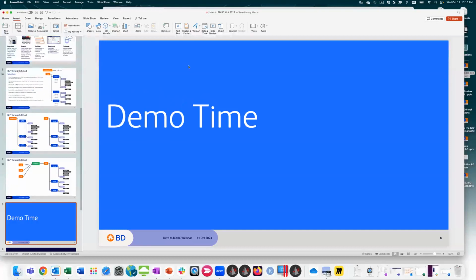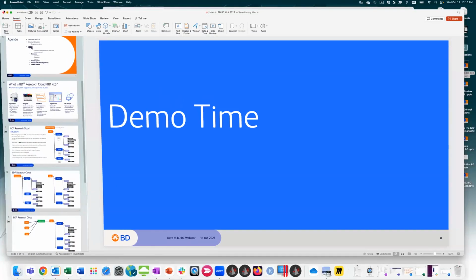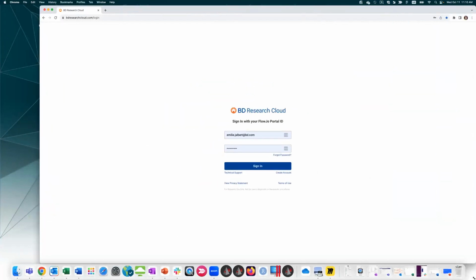All right, we're jumping over to the demo. So that was the brief overview of what is BDRC and how to stay organized within BDRC. I'll now make this bigger.